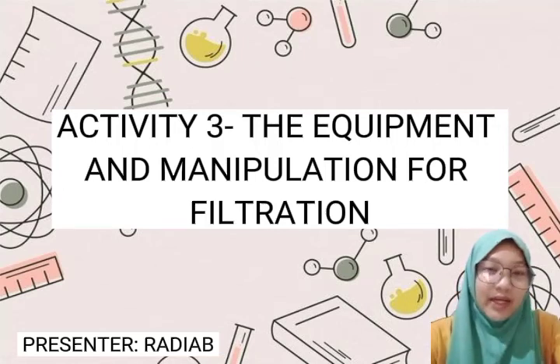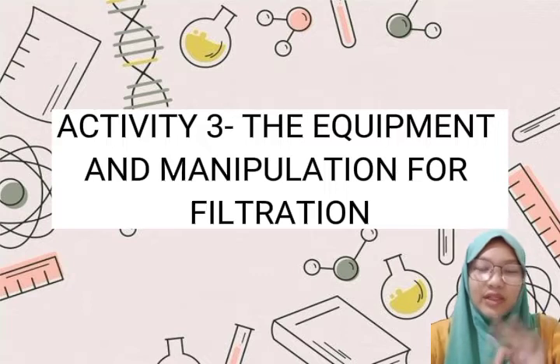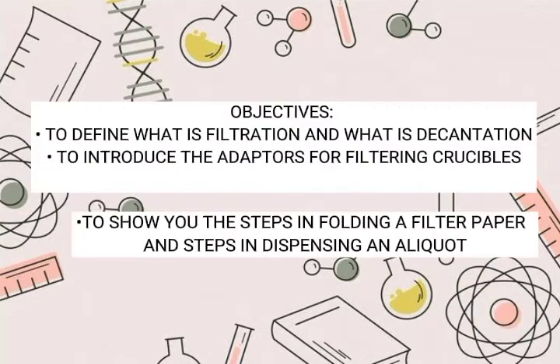Good day everyone, I am Najma Rajab and in this activity, I will perform the third activity which is the equipment and manipulations for filtration. So my objectives are to define what is filtration and what is decantation, to introduce to you the different adapters for filtering crucibles, to show you the steps in folding filter paper and steps in dispensing an aliquot.